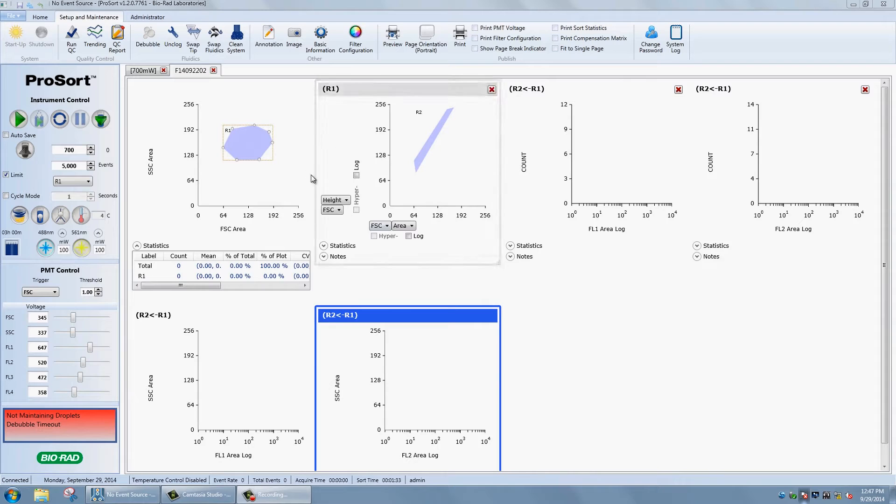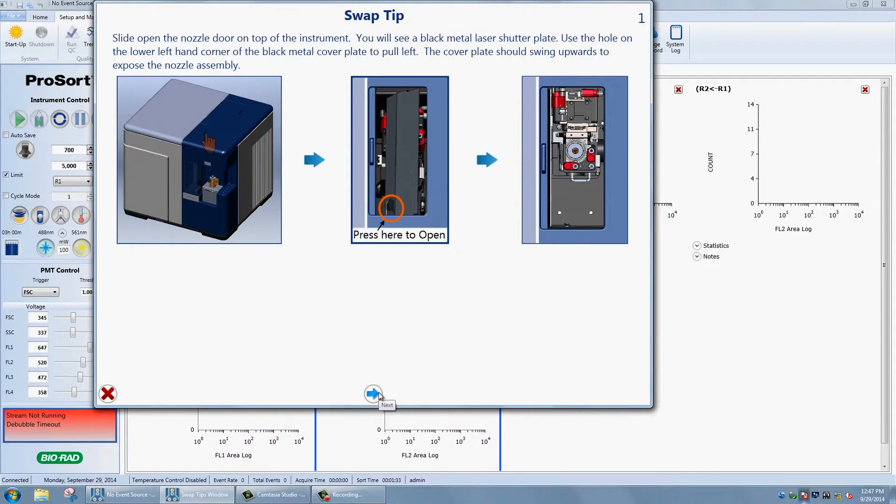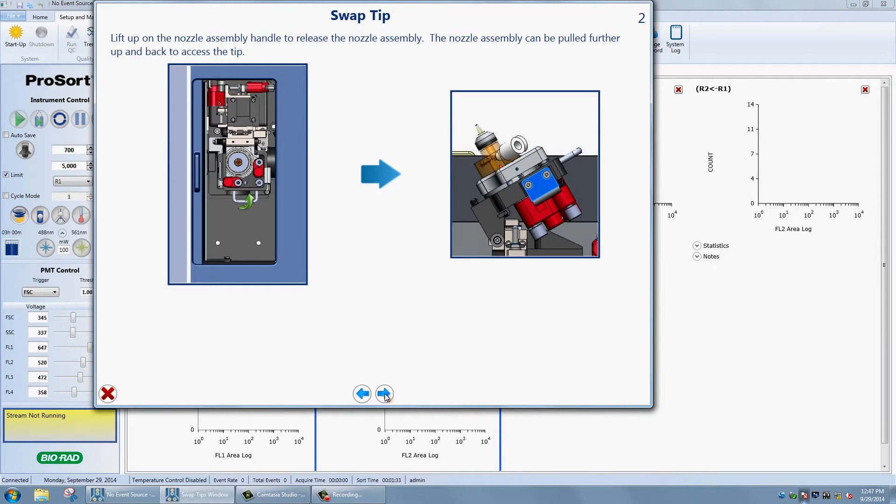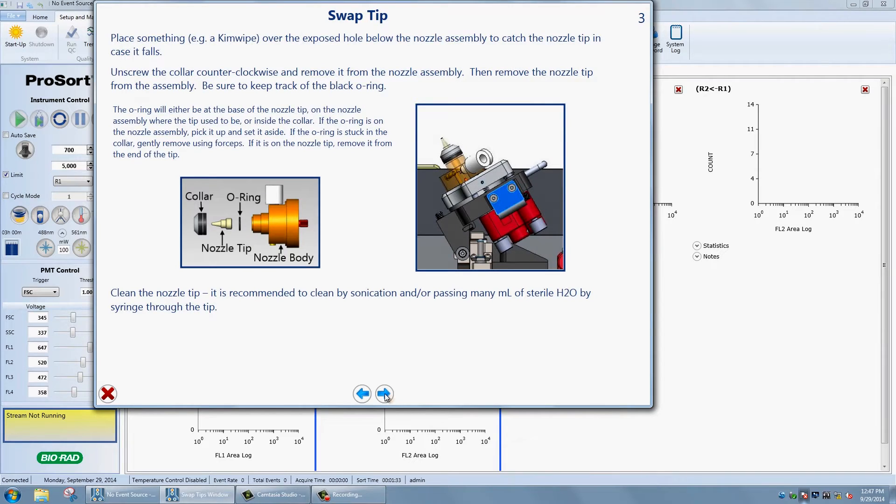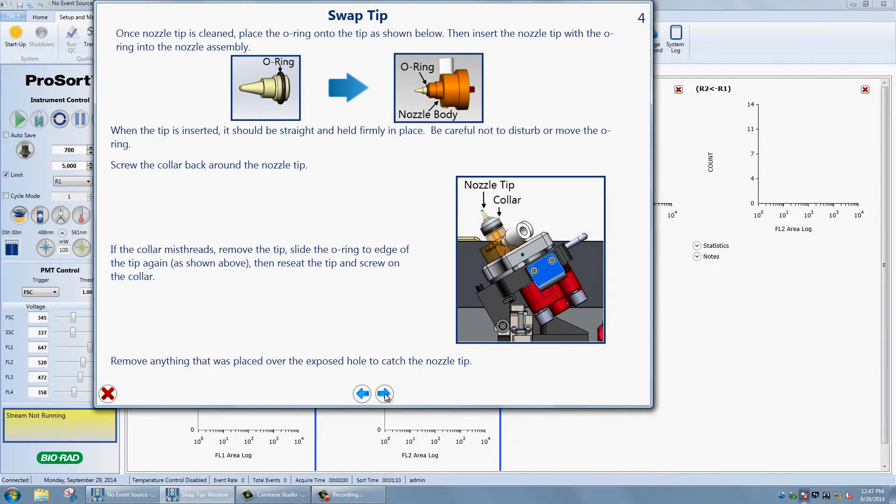By simply clicking the tip swap button within the ProSort software, you can easily change the nozzle tip and then sit back and watch the system make automatic adjustments that ensure perfect nozzle tip and stream-to-optics alignment and setup.